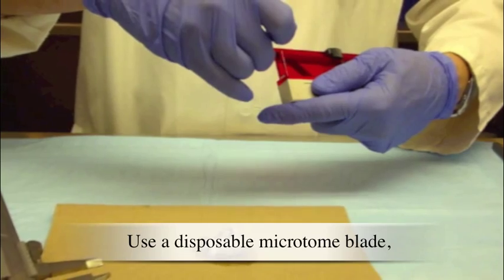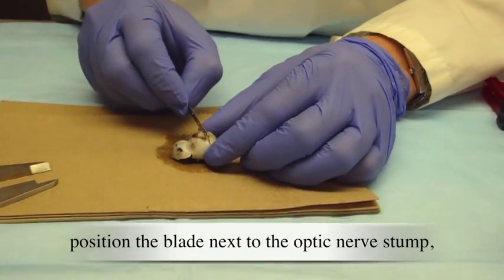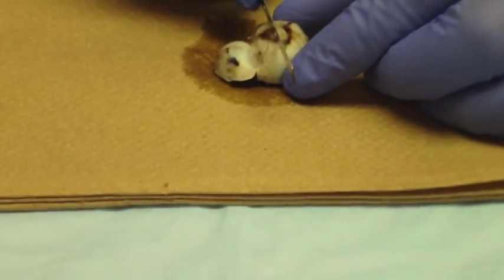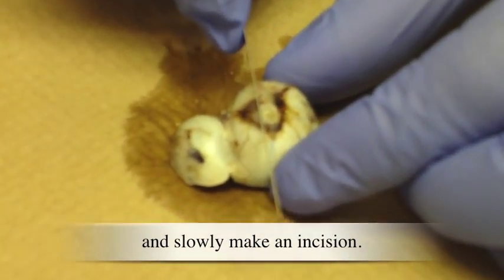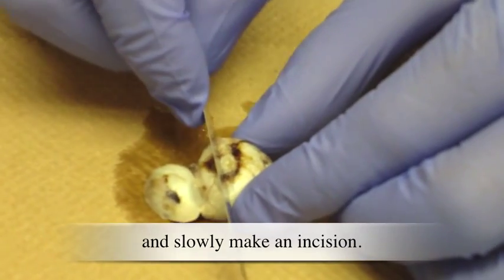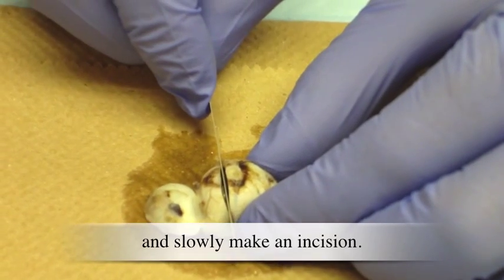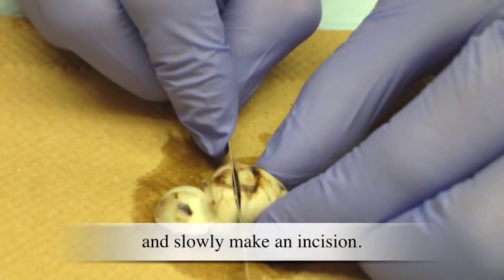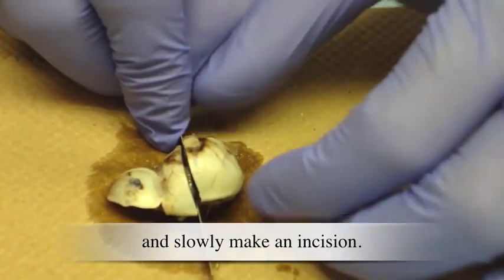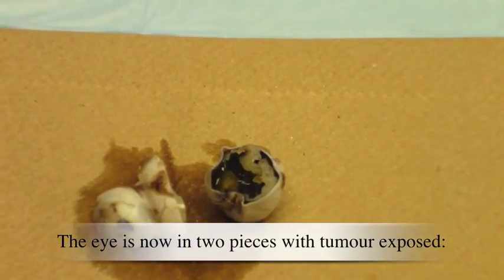Use a disposable microtome blade. Position the blade next to the optic nerve stump and slowly make an incision. The eye is now in two pieces with the tumor exposed.